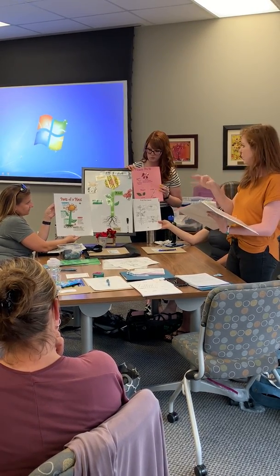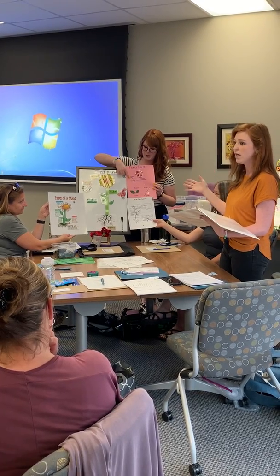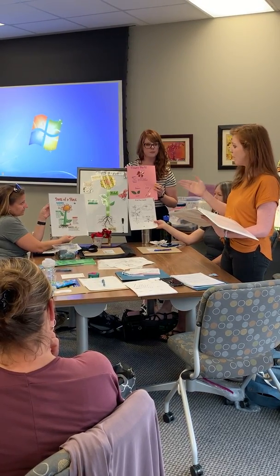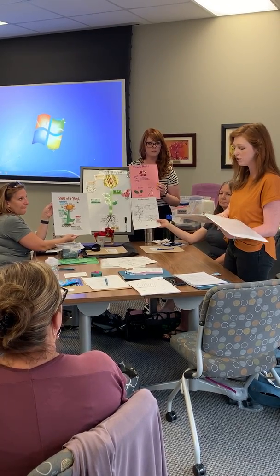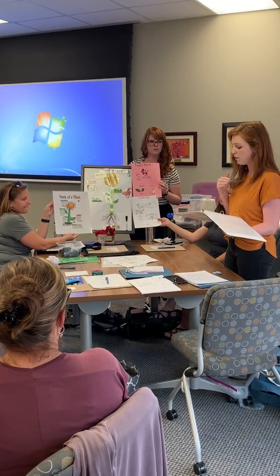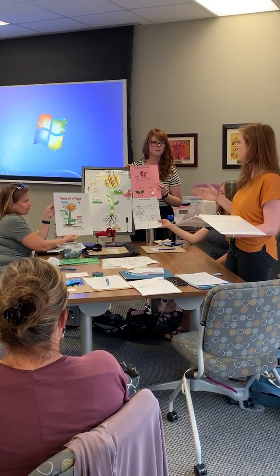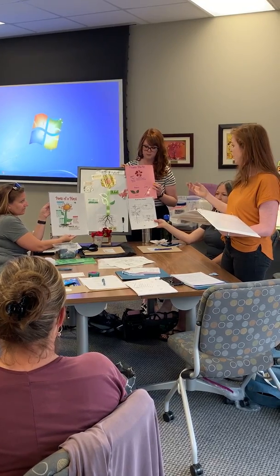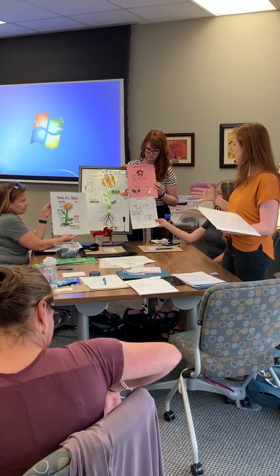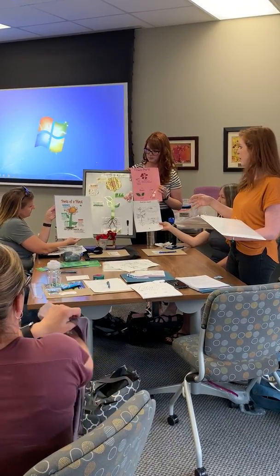And so what we did was we removed those, we taped them to the paper, we labeled what it was and what it does. And then we went through each part of the flower, and on our directions it tells you what to do. So after the sepal, we went with the petals that also protect the flower and attract pollinators. And then we went through the stamen and the pistil, which are the center of the flower, that contain the pollen, and that's like the reproductive parts of the flower.